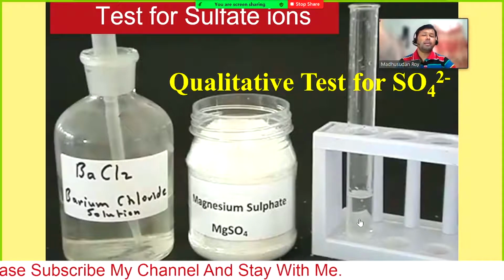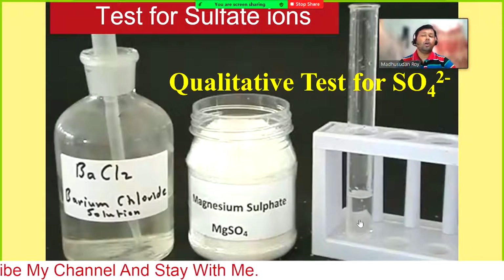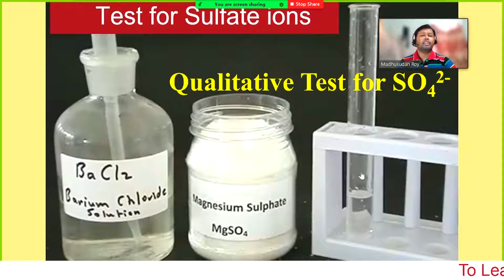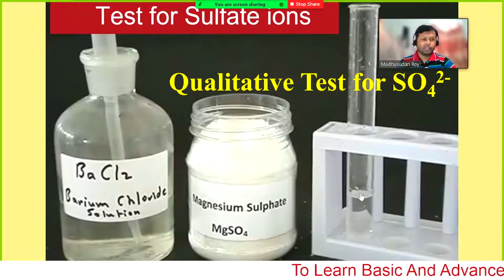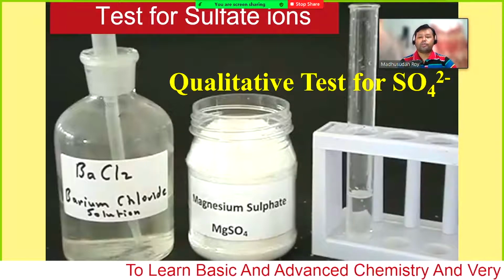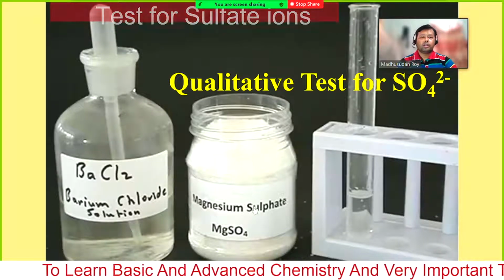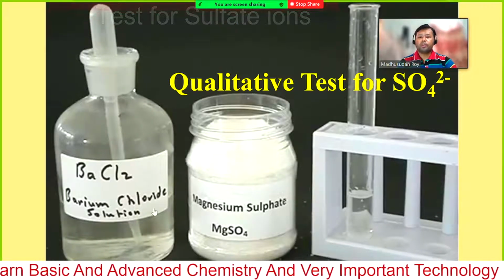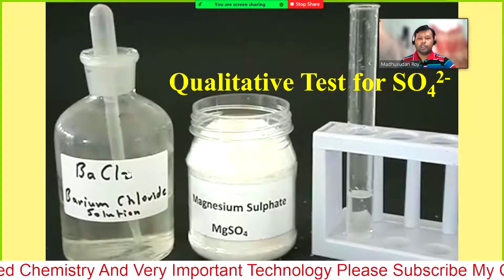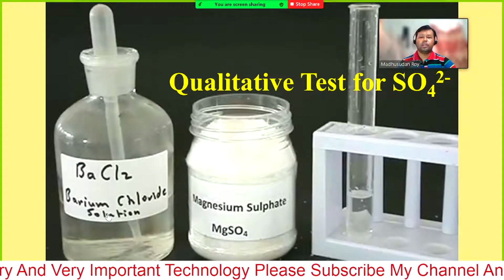If you have a colorful or white precipitation in the solution before the addition of barium chloride, that is not good. So take a small amount of salt and dissolve it in distilled water very well, so that there is no precipitation. Okay, let's consider this a clear solution. Then the addition of barium chloride, taking the barium chloride solution.